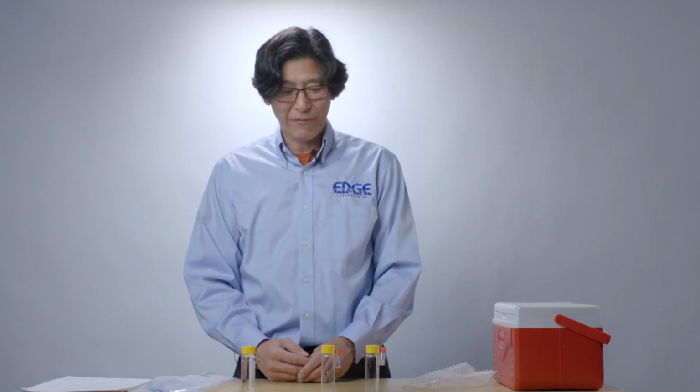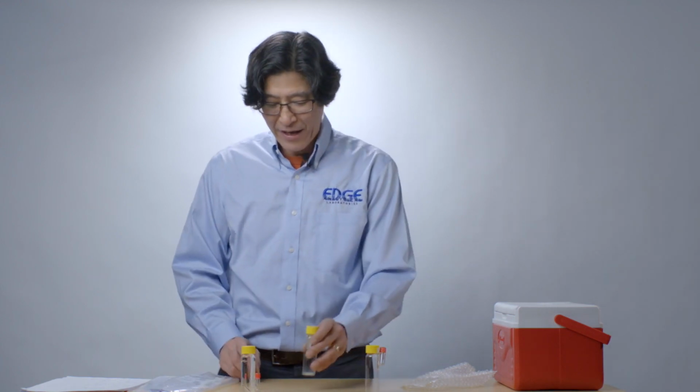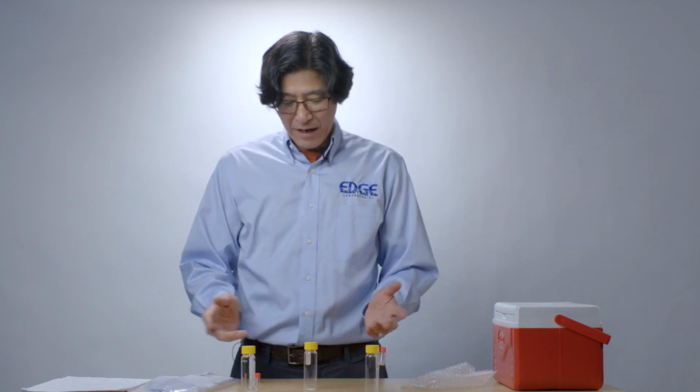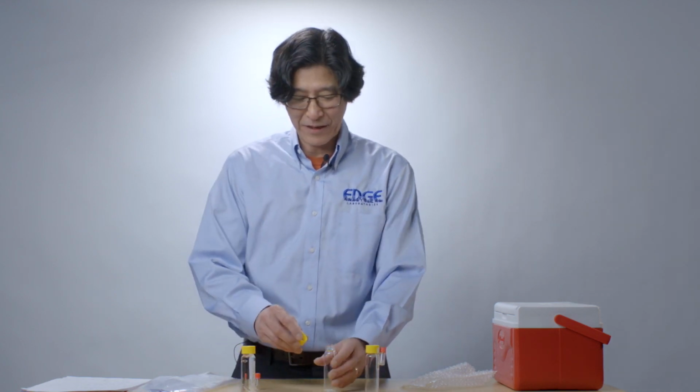So first off, we're going to get ready for taking the sample. So we're going to remove the red cap vial and get ready for this over here. I'm just going to show you what we're going to do. We're going to open up this vial here. We're going to be running some water out of the tap, and we'll fill this up. Once it's all filled up, we're going to seal it up and put it all back together again.